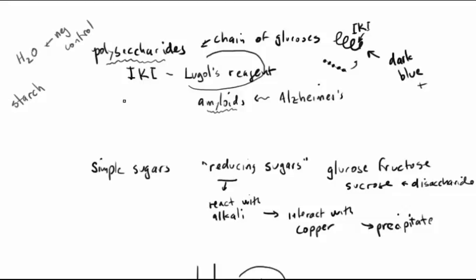I guess the idea here is that you want to convince yourself that starch really does give a positive reaction for this Lugol's reagent, whereas glucose, which is basically also made up of the same material as starch, except that it's monosaccharide as opposed to polysaccharide, glucose actually gives you a negative. Also, we're basically establishing that IKI does not have the same reaction with egg white, right? Okay, so it's like this. We're doing the water as a negative control, the starch is going to be a positive control, and glucose and egg white are there just to kind of convince ourselves that this polysaccharide reaction with Lugol's is selective. It's not something that will just interact with any old thing. It has to be the right thing.